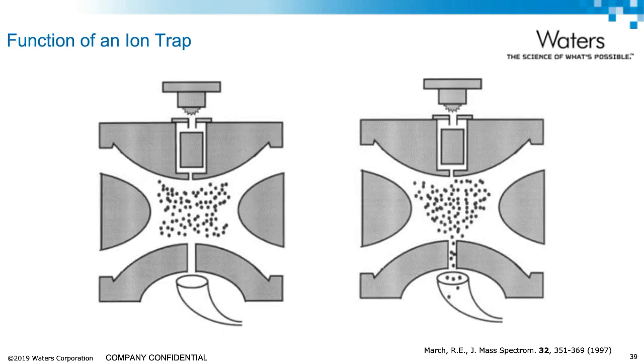The stable trapping of ions is shown in the left-hand side of the figure. A trapping RF amplitude is typically applied for between 0 and 30 milliseconds, during which time ions formed from the sample molecules are stored. For detection of the ions, the potentials are altered to destabilize the ions, resulting in their ejection through the exit end cap.